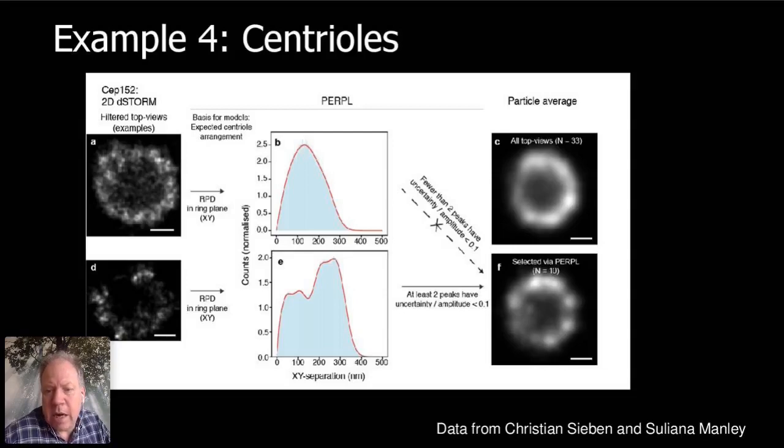Cohen Martins asks, how does the sample drift influence the RPD measurements? Well, what we like to think is we correct for as much of the drift as we can. Again, it will get wrapped up into some of the error in the RPD fits, like anything. In our lab, we have drift correction in action while we collect the data, and then we do drift correction using a fiducial afterwards to try and minimize that. So we don't tend to worry about it too much. But obviously, if things drift in space or time, they will end up blurring your results.